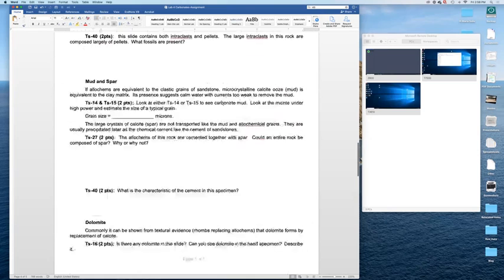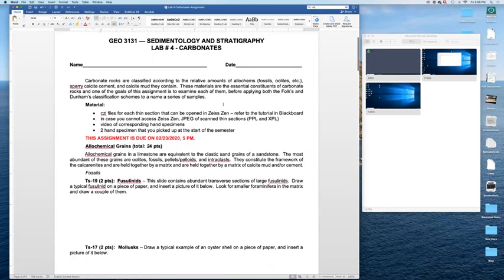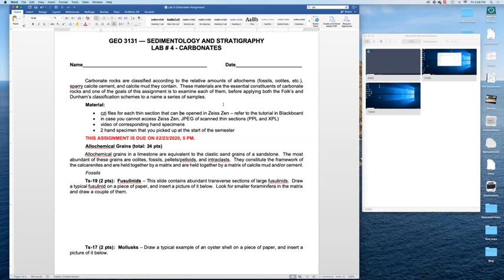Now how do you work with those thin sections? So there are two ways that you can work with those. If you are a PC user, you can use a freeware that is developed by Zeiss, that is called Zeiss Zen, and I will show you how to do that in a minute.